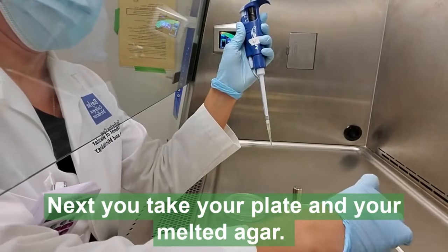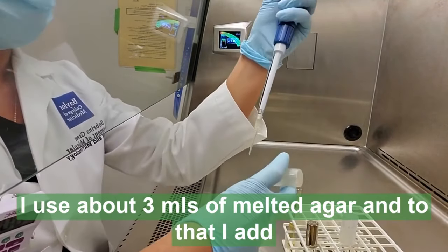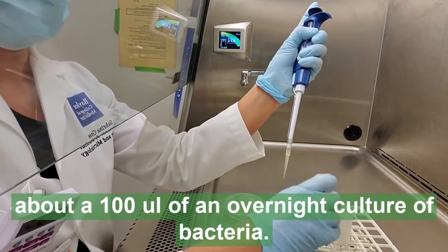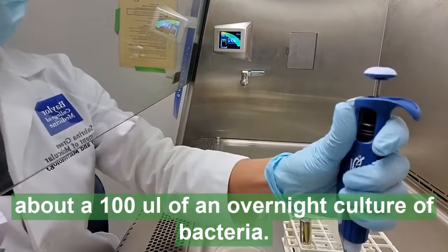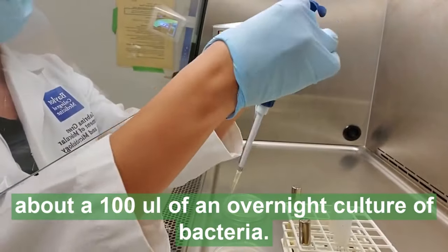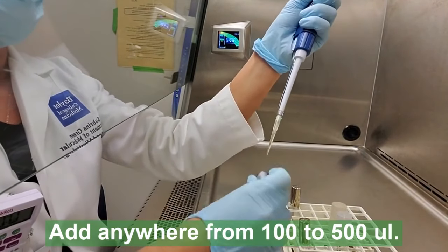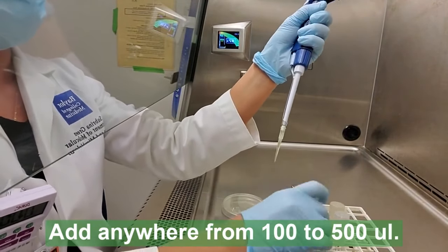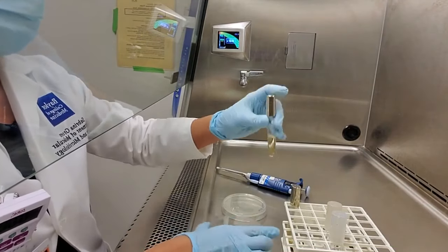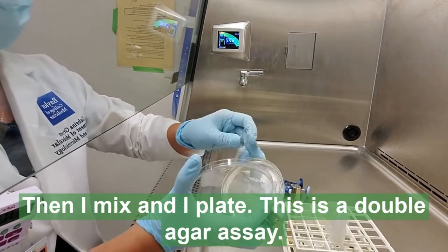Next you take your plate and your melted agar. I use about 3 ml of melted agar, and to that I add about 100 microliters of an overnight culture of bacteria. Then I add my fecal filtrate — you can add anywhere from 100 to 500 microliters to that same vial. I mix and I plate. This is a double agar assay.